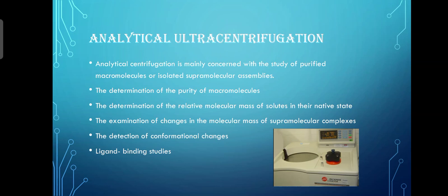The next type of centrifugation is analytical ultracentrifugation. Analytical ultracentrifugation is mainly concerned with the study of purified macromolecules or isolated supramolecular assemblies.